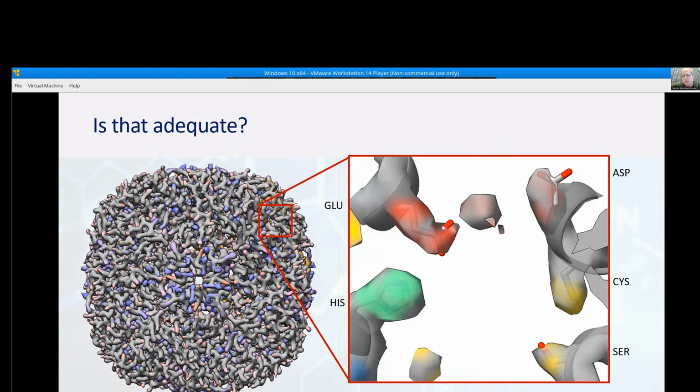In other words, the statistical tools that would lead to the three-dimensional structure will be oblivious to the chemical information that they're looking at, which means that we have an orthogonal piece of information to validate that the glutamate in a place is really glutamate because it decays quite quickly, while histidine, which decays slowly, is histidine because you see that it is decaying slower. And the colors here represent the rate of decay from red to blue.